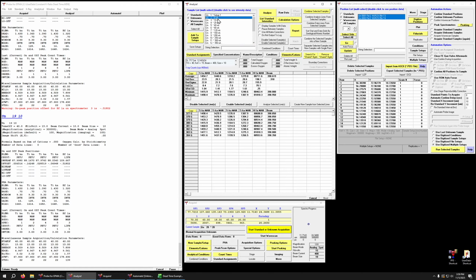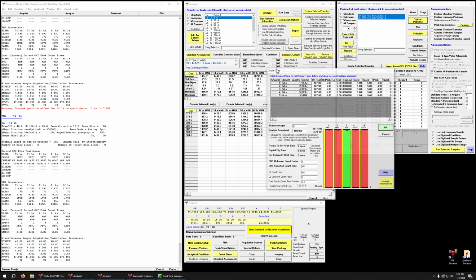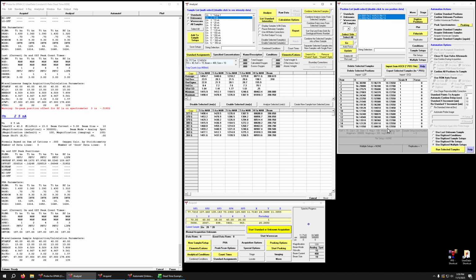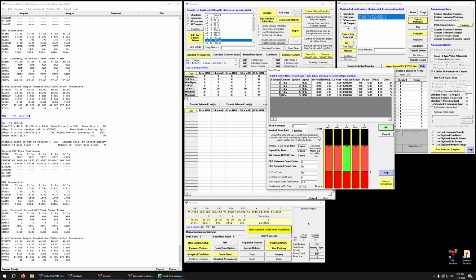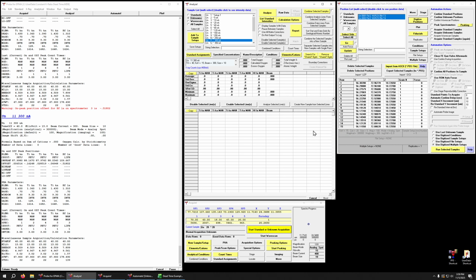You may also want to alter the count times individually. So you can see here in this one, I've got my count times are quite high, right? Because at low current, I'm getting fewer counts. I'm not going to get as good at counting statistics, and there might be a little more slop in my measurements. Versus up here, I'm going to be having 100,000 counts. I don't need to count near as long, so I've shortened the count times dramatically there. So that's not a bad idea.